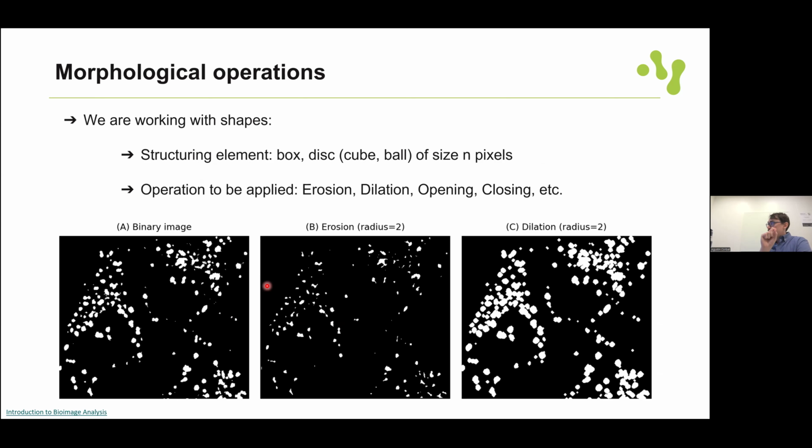So you can easily show what was changed from one image to another. So by applying subtraction, you can show what the differences were. Or even summing, and then you have 3 levels or 4 levels. You can be very creative with all these things. Thank you for the advice.